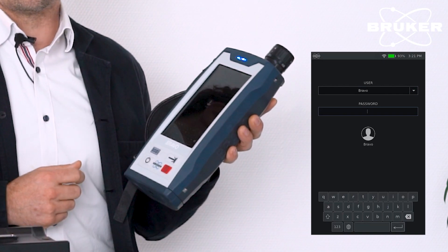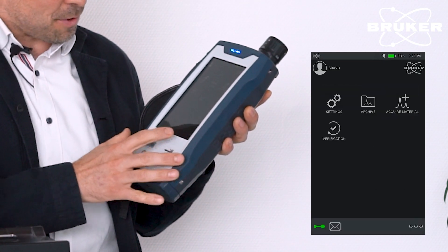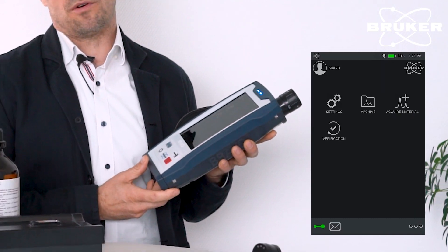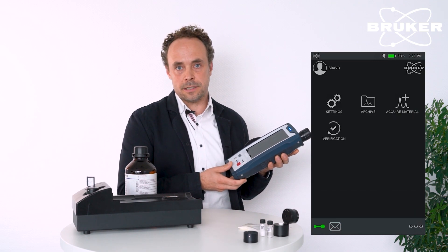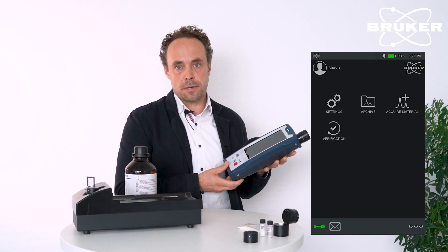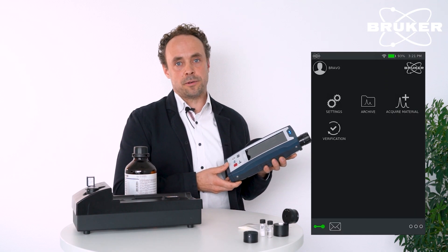I have here a small demo account on the equipment — no need for the password — but of course this can be all user defined. We can specify password complexity, length, expiration periods — all the features you would expect from a modern user management system.